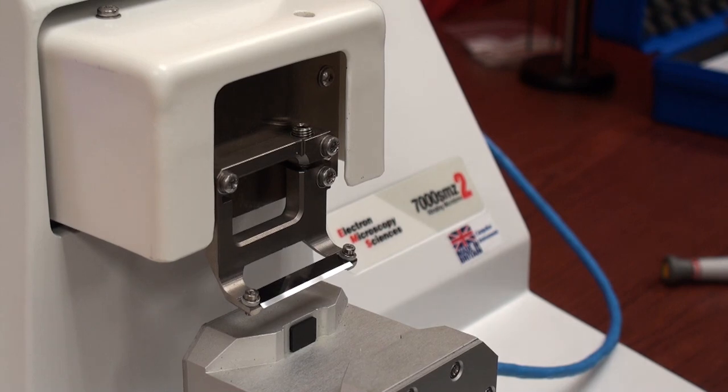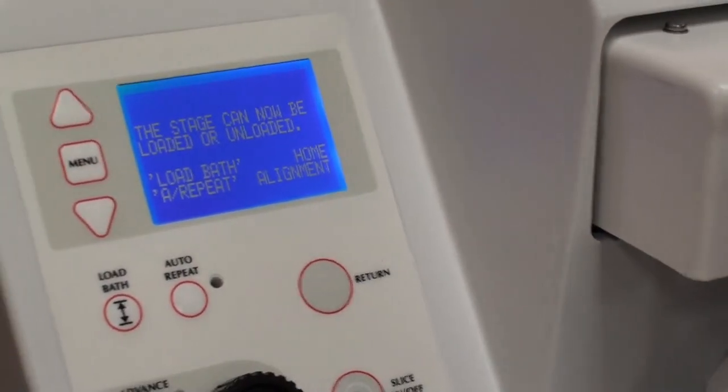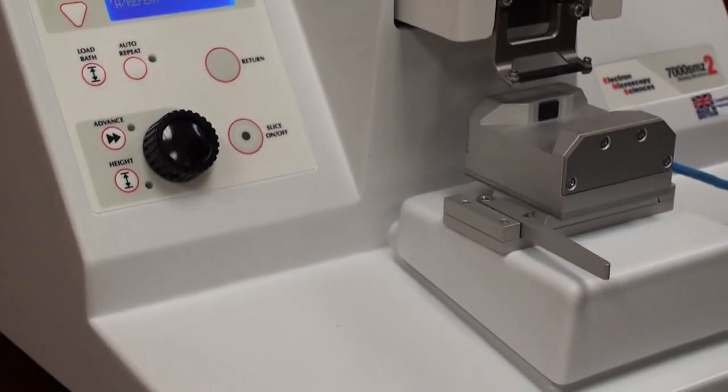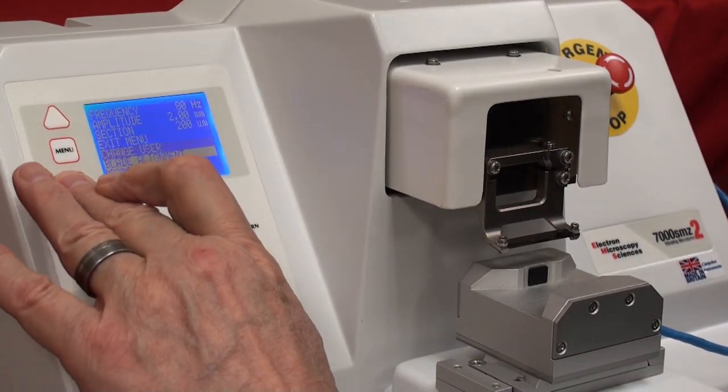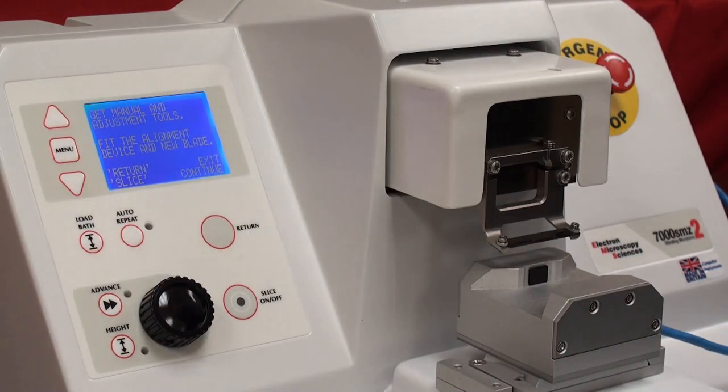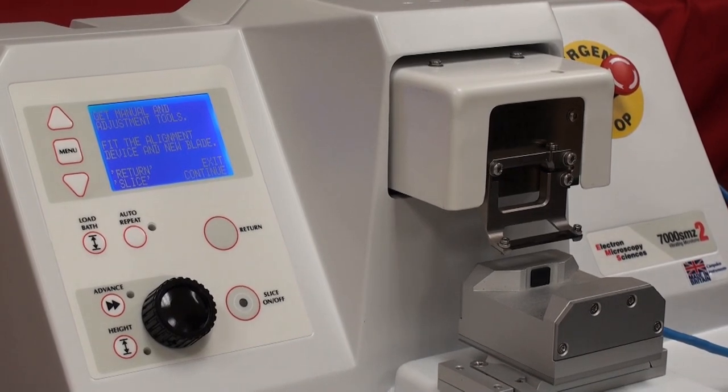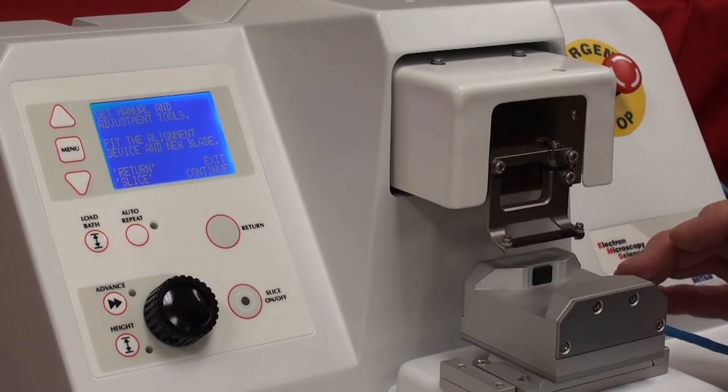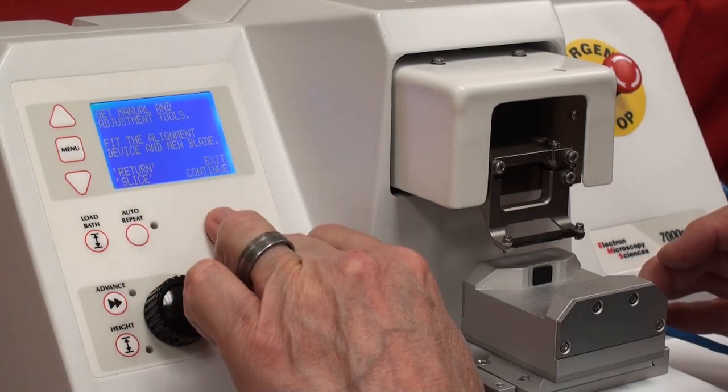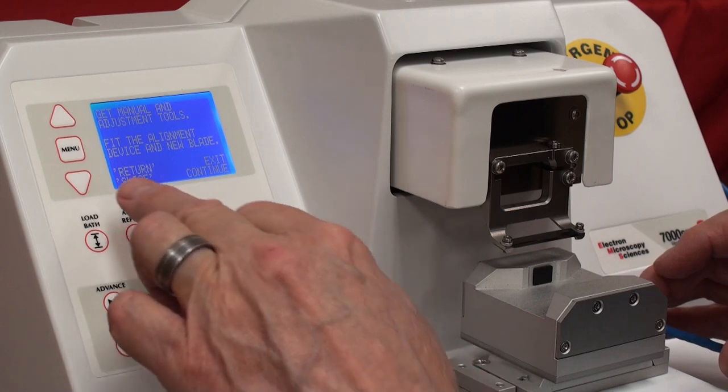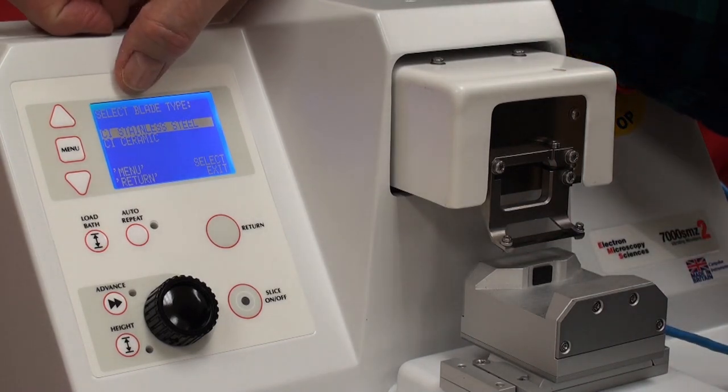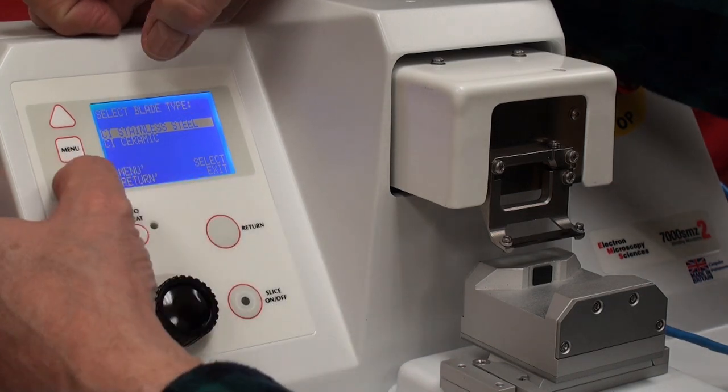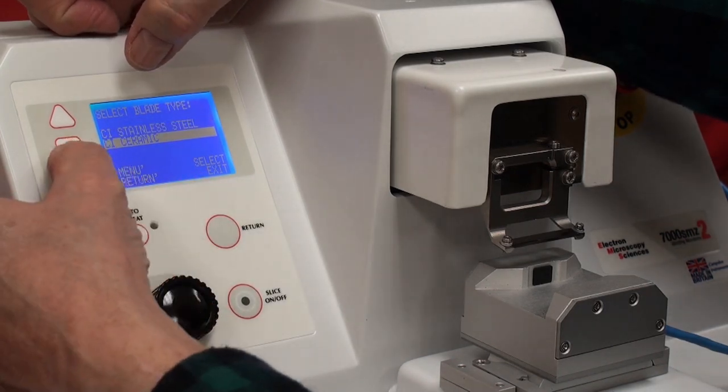Select blade alignment. Let me move this back. Let's go back to menu. Select blade alignment. Enter. Get the manual and adjustment tools. Fit the alignment device in a new blade, which I've done. Return. If you press Return, it'll exit you from this operation. Or if you hit Slice, it will continue. It asks you what kind of blade that you put in there. A stainless steel blade or a ceramic blade. In this case, I put a ceramic blade in. Hit Enter.